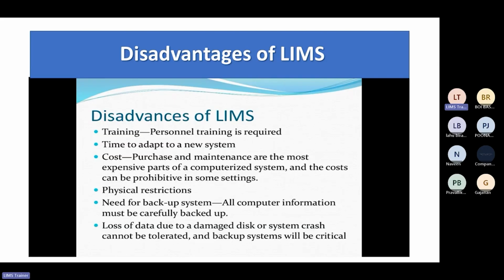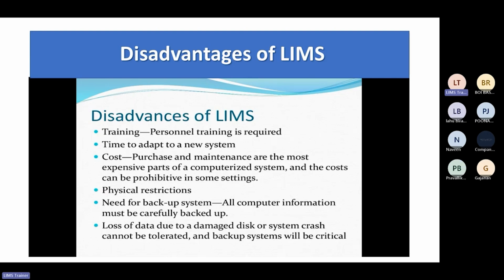But consider one small laboratory which, in manual mode, is working only for 5 hours in a day, and there the software is implemented. In such a case, it will be a huge cost for that laboratory, right? Because the work is already less in that laboratory. So it will be a high cost for that particular laboratory. This is how the cost is calculated, whether it is benefiting that particular laboratory or not. That is calculated before starting the project.